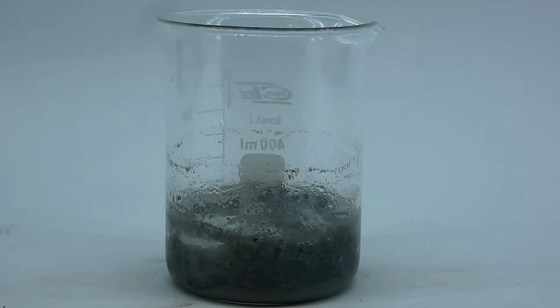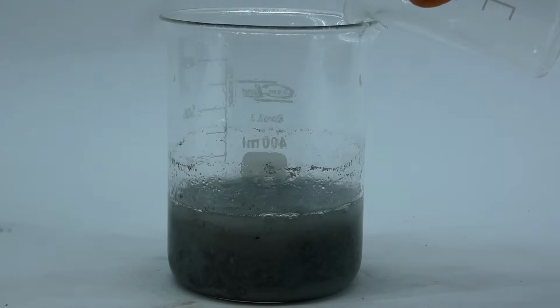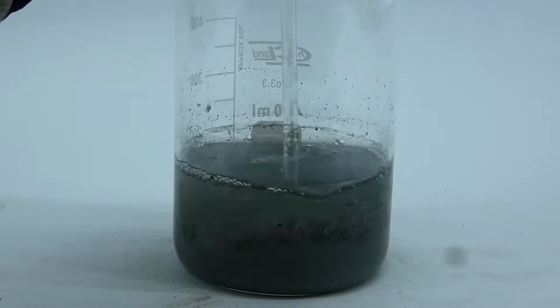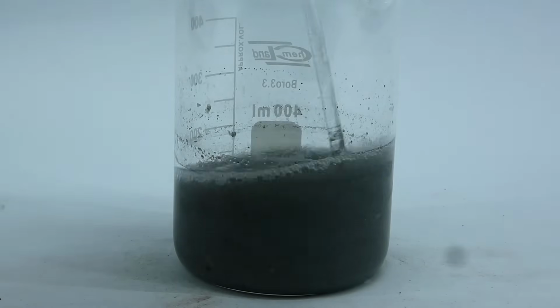Anyway, I added another portion of 50 ml of the acid for good measure, and left the mixture to react for the night. When I came back in the morning, the smell was mostly gone, but the reaction was still going on very slowly, but I just ignored it and proceeded to the next step.